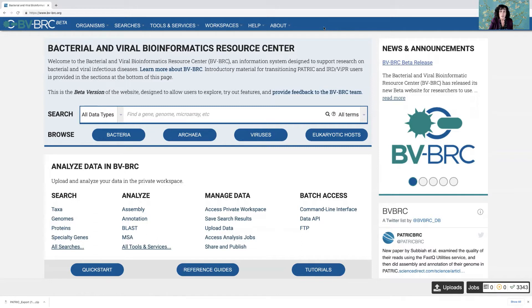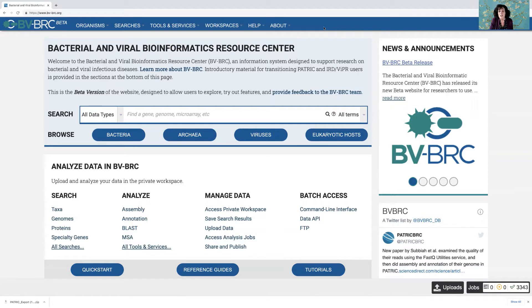For people who have been using PATRIC, they'll find that it's pretty easy to submit jobs using BVBRC. IRD and Viper folks are going to have a little bit of an adjustment, but really stick with it because it's very easy once you get used to it.